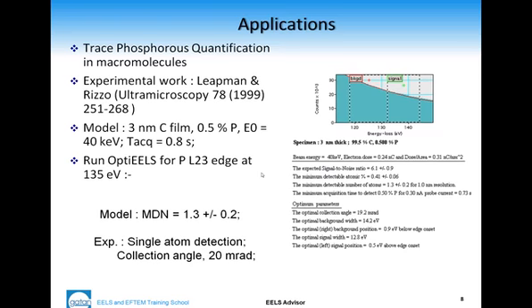So those are the main features of the EELS Advisor software. We have the simulation, which is used as the basis for the optimization at the edge. And the optimization works in different spectrum modes. It works for both the single particle analysis and for mapping in the 2 and 3 window case.